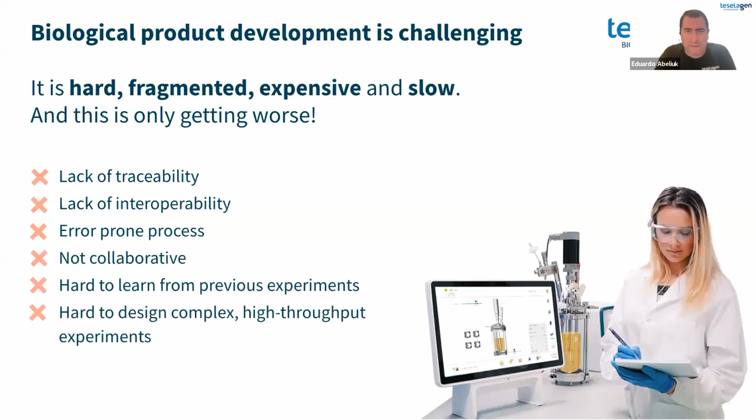Thanks, Jota. Welcome, everyone. Before diving into today's topic, I would like to start with a brief, very high-level overview of Teselagen, why we exist, and what our platform is all about. As many of you know, developing biological products comes with significant challenges. There are underlying experiments on one hand, and processes tend to be fragmented, inefficient, and prone to error.